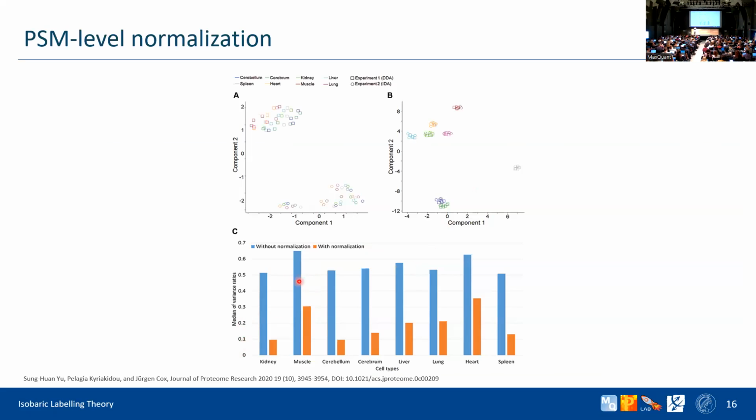So the blue is when you don't use normalization, and the orange is where you do use it. So you're actually normalizing for mixing, is that right? We are normalizing so that we are able to compare between different, like let's say you have 2 8-plex experiments, and you want to compare between them. So now you have 16 samples that you're comparing. So you're comparing different plexes. Different plexes. All right. Between plexes.